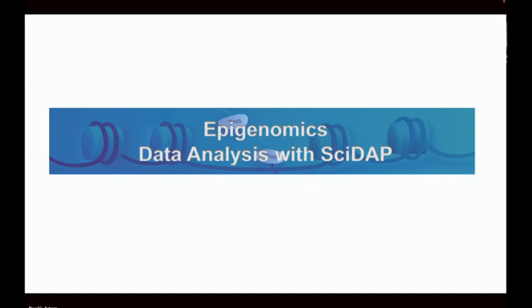Next, I am going to show you how the platform works for the analysis of epigenomics data. But if you have questions at this point, it's a good time to ask them.